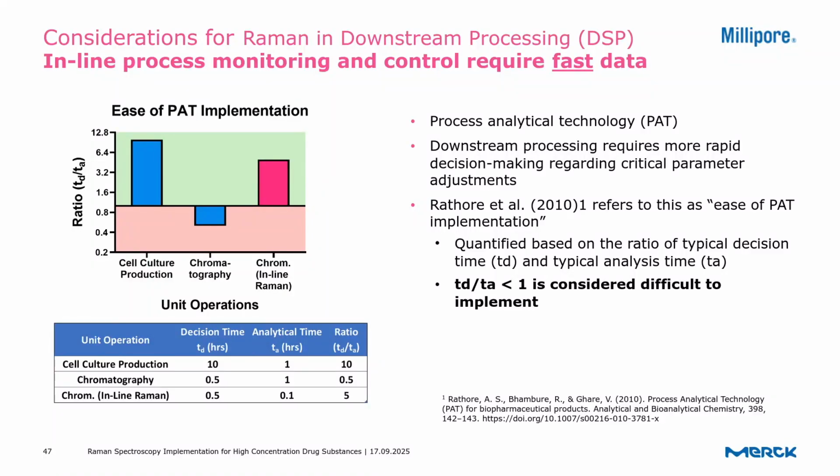In this slide, I'm going to touch on some of the challenges with implementing inline PAT into downstream processes, specifically surrounding measurement time requirements in upstream versus downstream to support inline measurement capabilities.